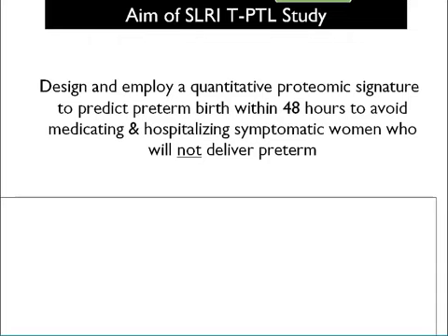And what we've done is we've taken white blood cell guts, lysates, from white blood cells, and we've tried to do SWATH on them. The idea is to try and find out a difference, because if inside the white blood cells is the mechanistic molecules to say, hey, we need to deliver this baby now, then maybe we can tell the difference between a woman who's about to do that right now and one that's going to be doing it at least a few days later, if not weeks.